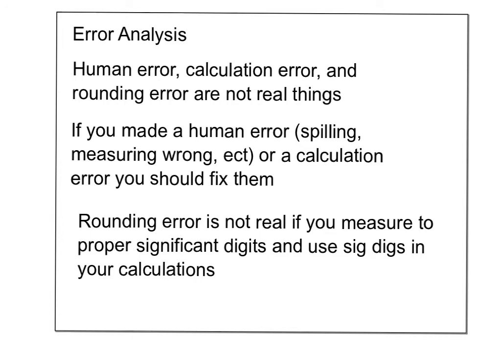The other thing that a lot of us talked about was because we did 2 trials, you mentioned that you used different amounts of the HCl. That is fine. If you use more acid, because remember the point of it turning pink is that that's when moles of the acid equals moles of the base. So if you had more acid to start with in your flask, it would have just taken more base. And then you add more volume, right? So you should have been able to get the same result because you're dividing by a larger volume that time. So having different amounts shouldn't have made a difference because we are doing separate calculations and averaging.